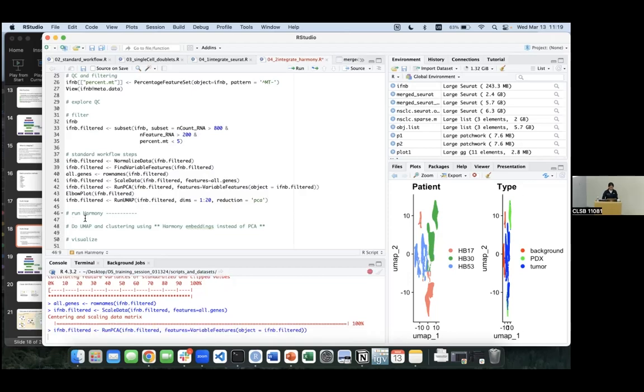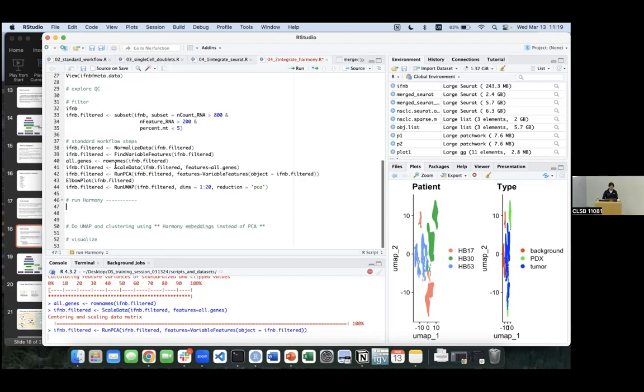So this is very straightforward. I'm just gonna put it in here. We are gonna use tidyverse here to make everything easier. Oh, this is on Mac. If you type Command-Shift-M, it will just pop out this piping.